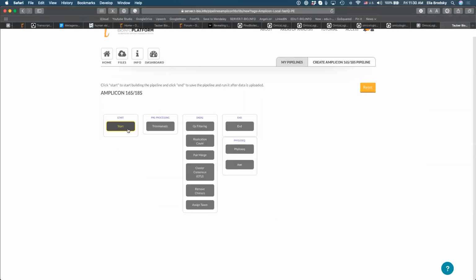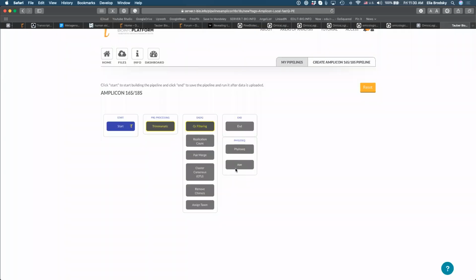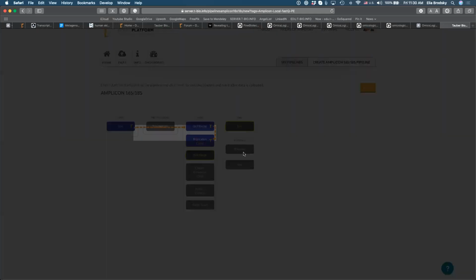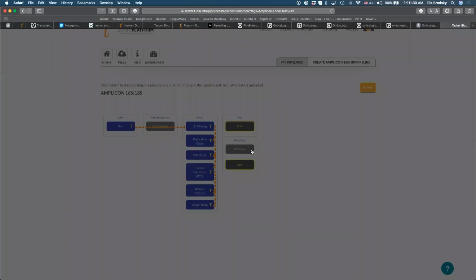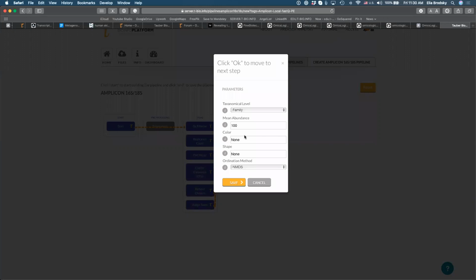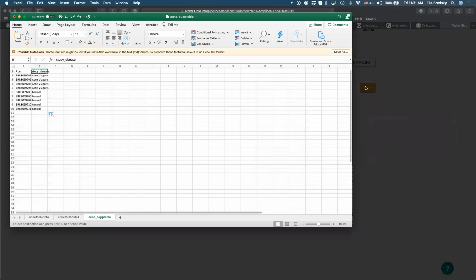And remember, when we're building our pipeline, we're going to be doing the same thing, but we're going to be using our control data, the group data, for coloring. Okay, so here, again, we'll use phylum. And for color, we will use study disease.